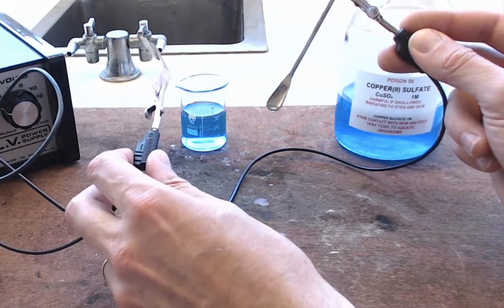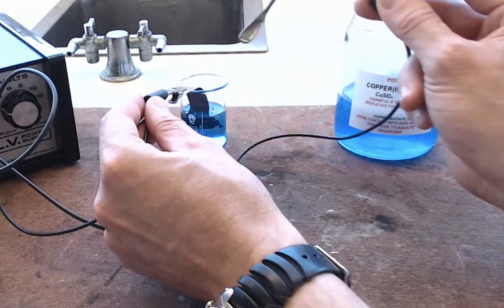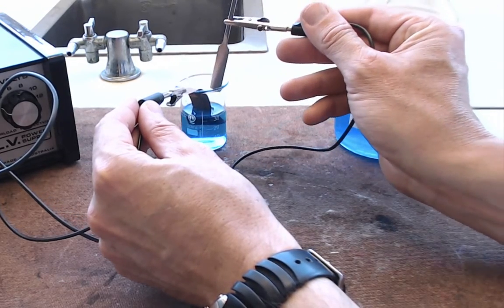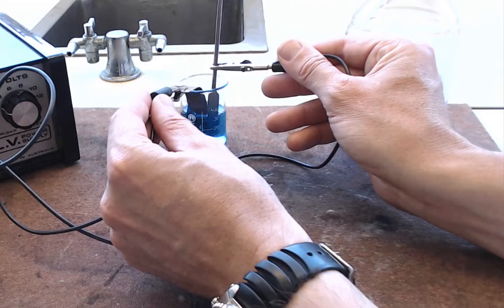Then we're going to do a very similar thing. We're going to put our electrodes in the solution again. You might want a clean part of the metal that you haven't plated yet, so you might want to turn it round.